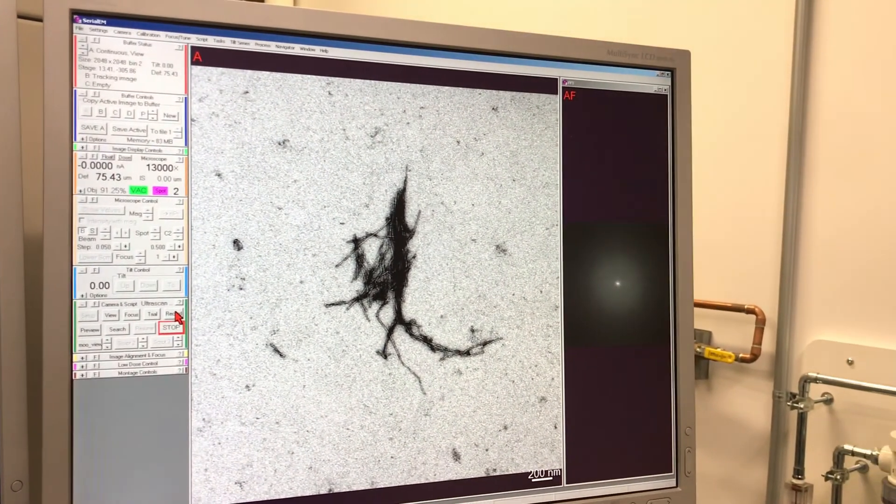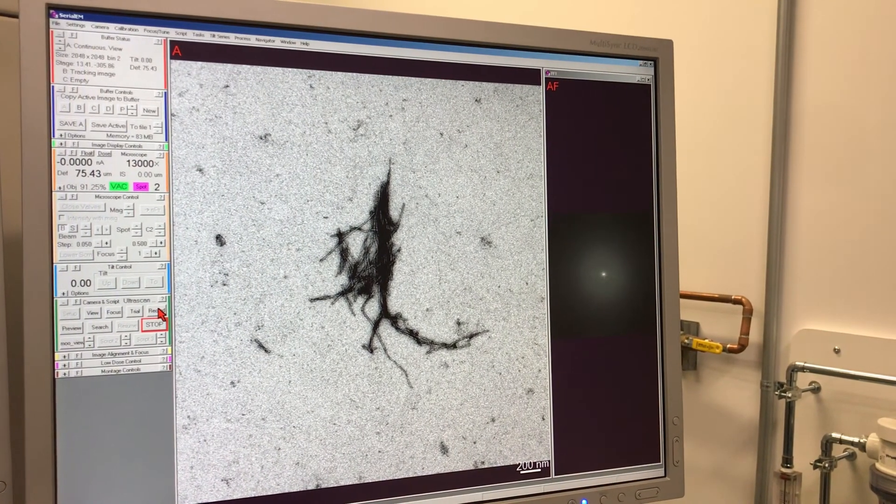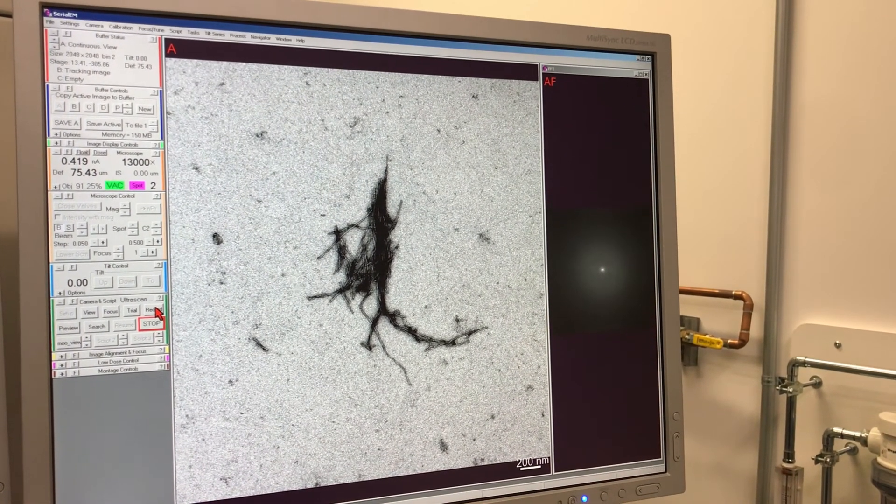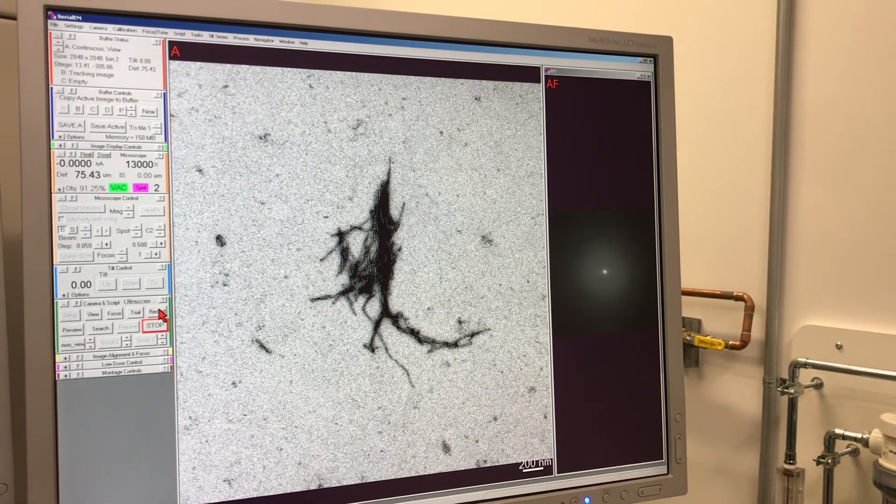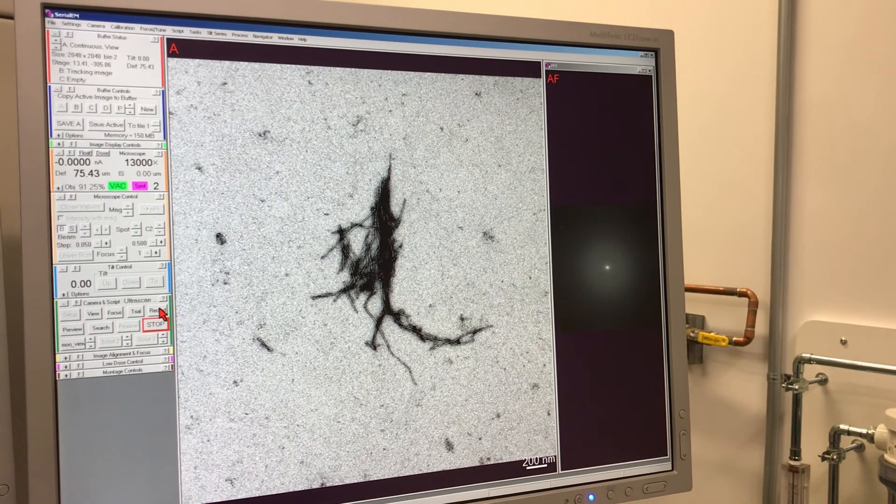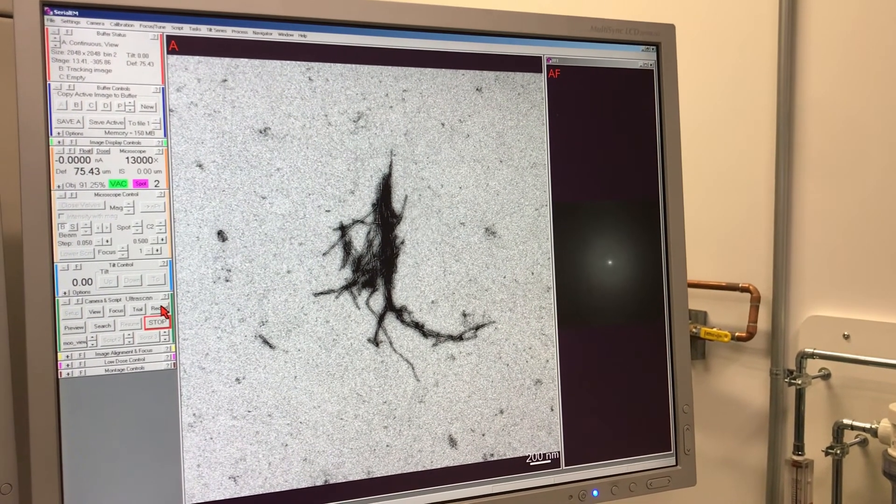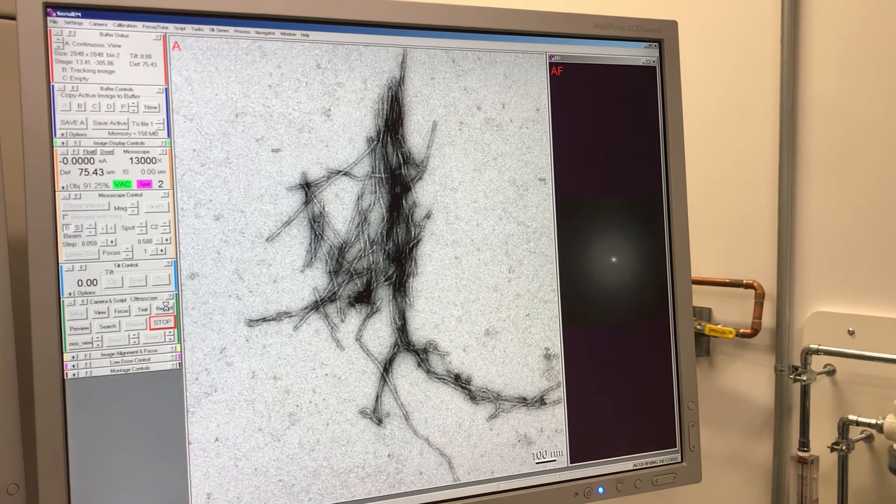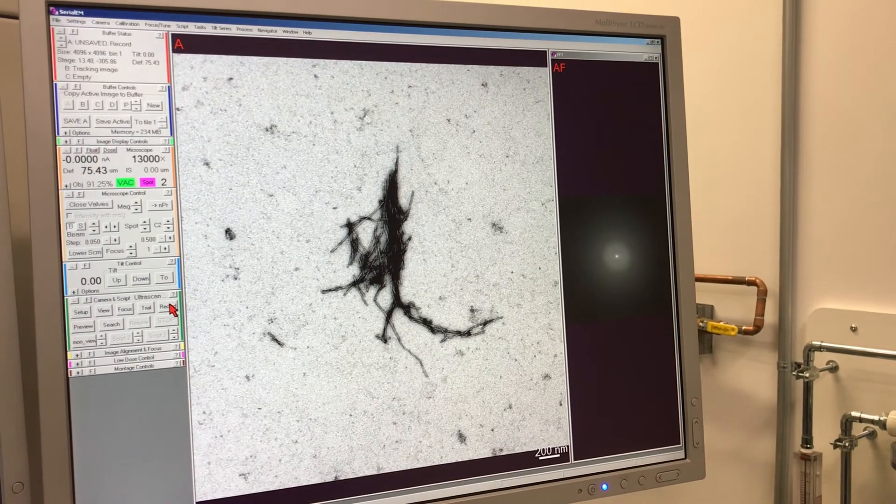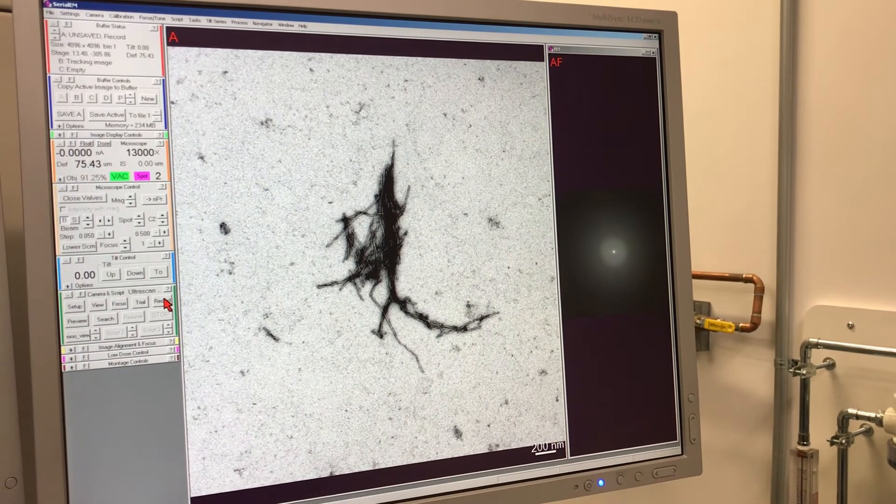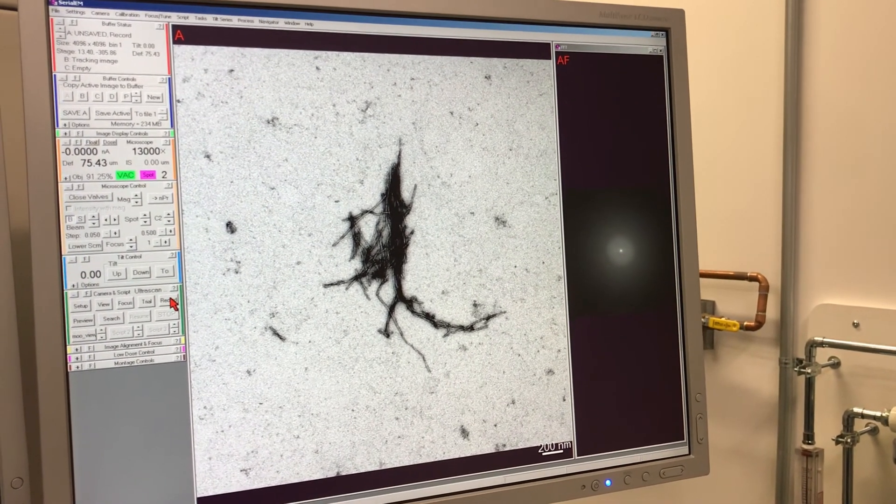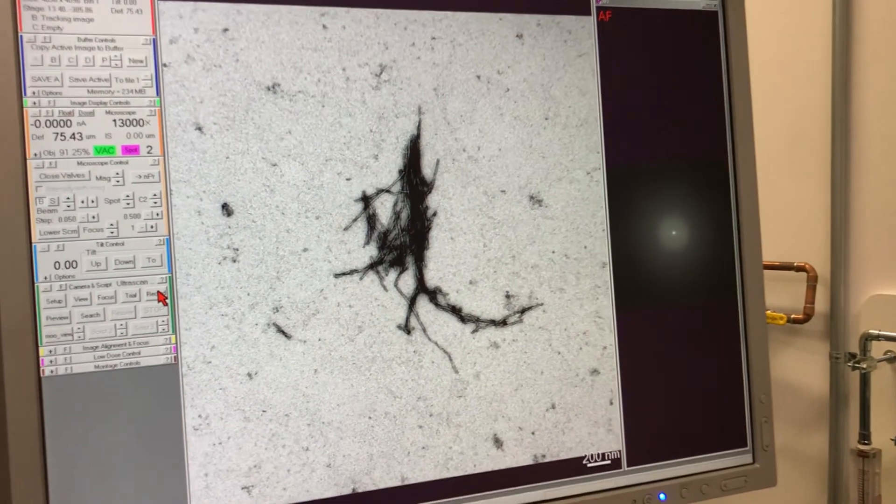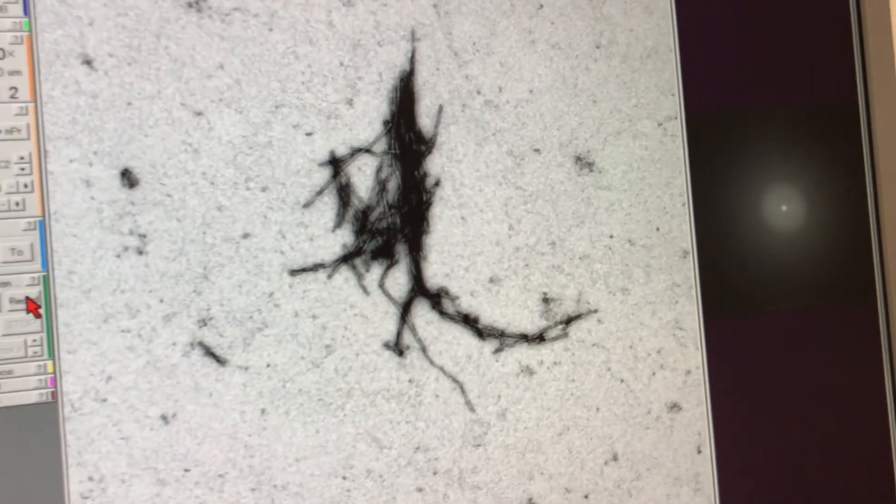For visualization, we can then go to another area of interest where we can find another bunch of amyloid fibers and repeat the same process, where you always fix the Z height or the eucentric height first and then you determine what focus we are at, and then keep on changing the focus until you get the right features from your object or protein of interest.